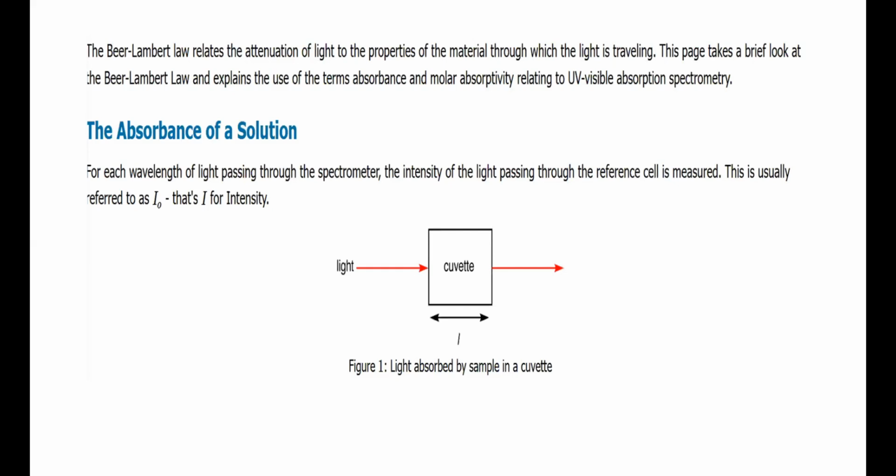Today's topic is about introduction to spectrophotometer, right? So, when it comes to spectrophotometry, of course, it is all about how the light travels through a given solution and the absorptivity of that solution, what amount of light it will absorb, what amount of light will get transmitted, and on the basis of that, how we can characterize the analyte in the sample.